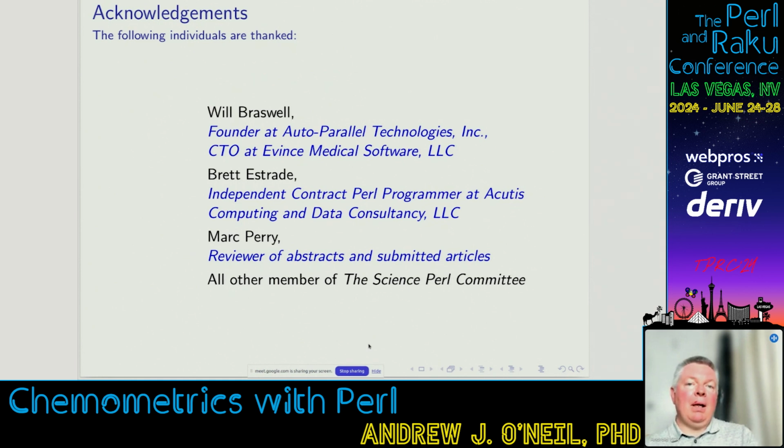Basically, all it requires is models produced of the genuine substance before those inspectors would go into a facility. And as long as they've got models that they've validated of the genuine products, then they could take the counterfeit versions. And if the spectra come out significantly different, then they've got a very useful device that is handheld. It can be carried around in a very small case. So I think that's distinctly possible. So there's a lot of field applications. I think so. Yes.